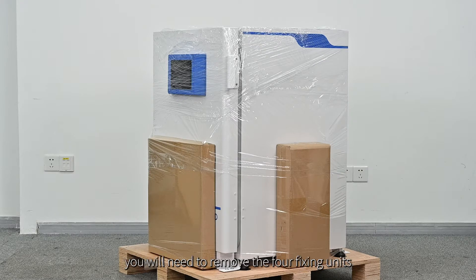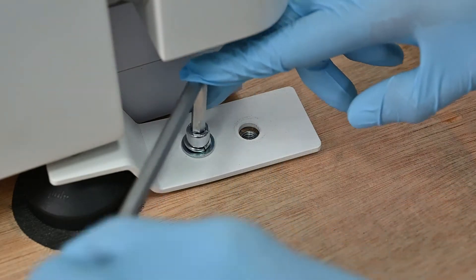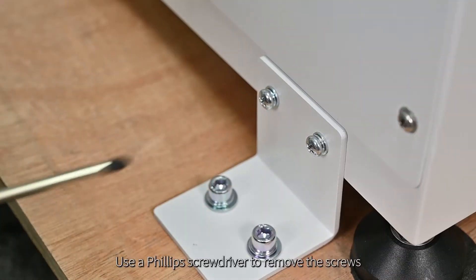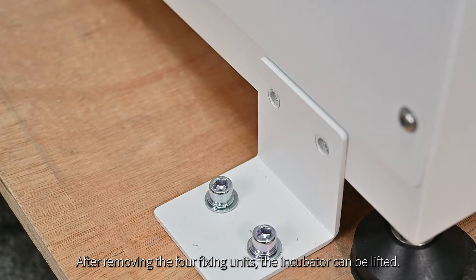Before removing the incubator from the board, you will need to remove the four fixing units at the bottom of the incubator. Use an Allen key to remove the screws from the front of the incubator and remove the fixing units. Use a Phillips screwdriver to remove the screws on the back of the incubator. After removing the four fixing units, the incubator can be lifted.